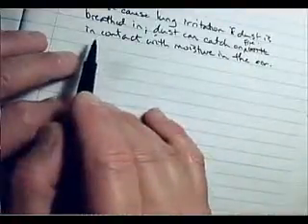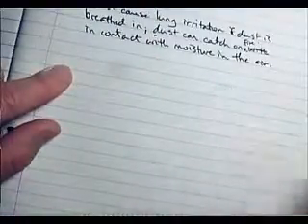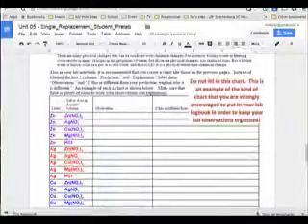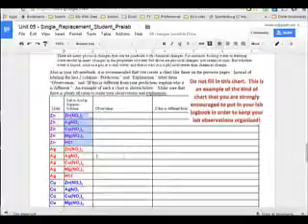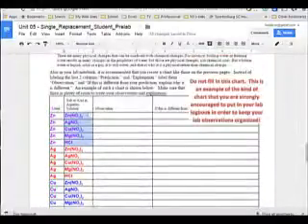All right, now you're going to continue with all the other metals. You're going to look up silver and copper and magnesium, and you're going to put all of that under metals. That make sense? Yes, sir. However, for the compounds, let's go back to all these compounds here, each of these have to have separate listings for hazards. Okay? Now, how many compounds do you have? 4. 5. And they repeat themselves, same compounds. See that? Mm-hmm. All right.